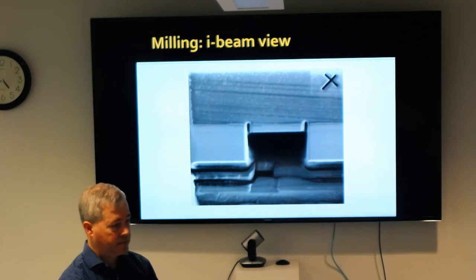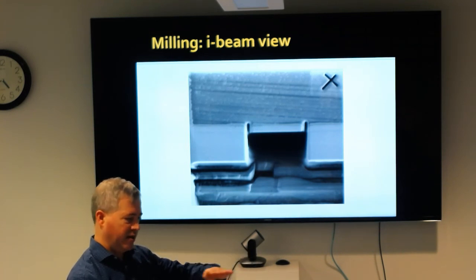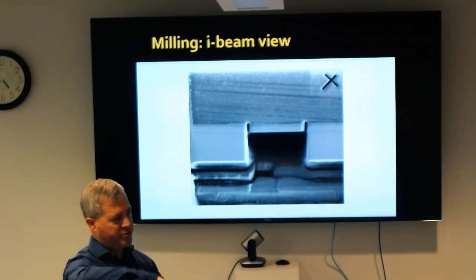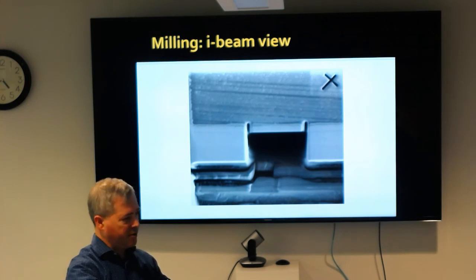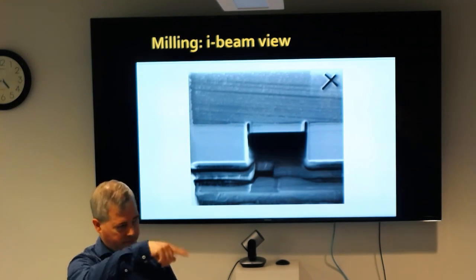Why is there a curtain effect on thin slice? Oh yeah, that's a good question. Sometimes, if the surface isn't very even, the ion beam hits things at different densities, it won't cut as well, and it leaves a mark going down, which we call curtains. With the ice, probably it wasn't very smooth when it was milling, and it's kind of hard to deposit platinum onto it very well. So I think that can cause a curtaining effect as it cuts. It leaves a surface mark on it.